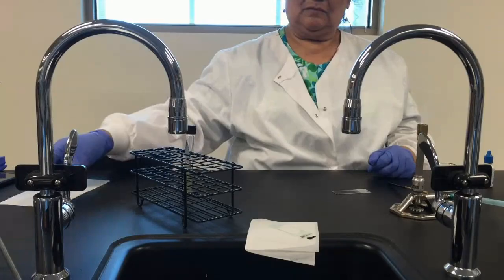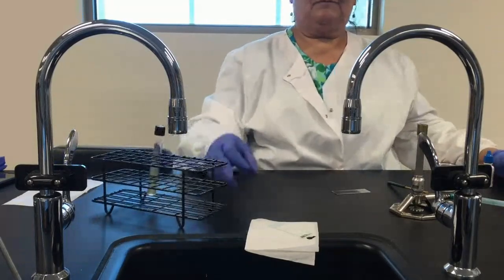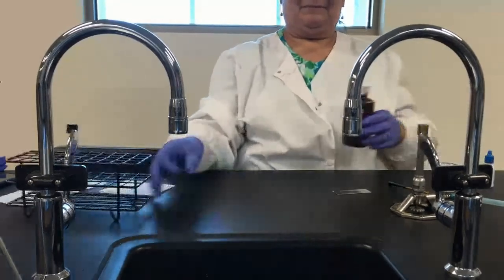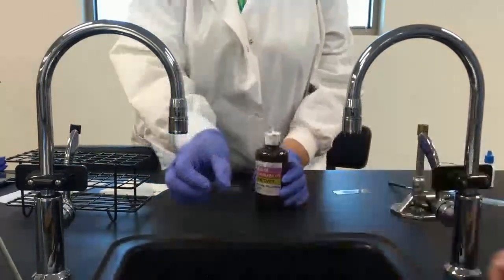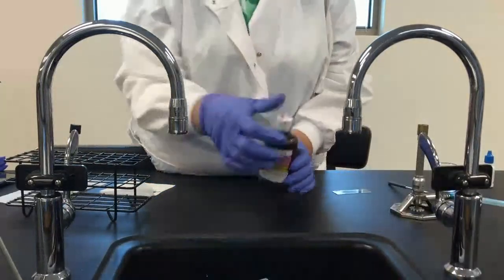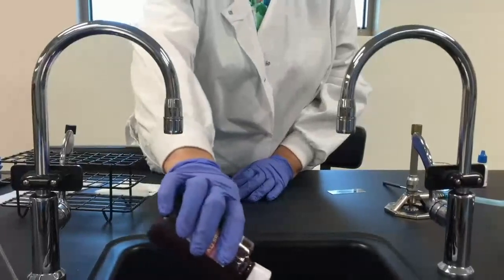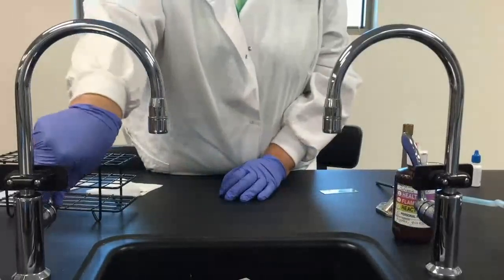Then we are going to take the slide and put it on a staining rack over the sink, and we're going to cover it with safranin. We'll leave the safranin on for a minute.